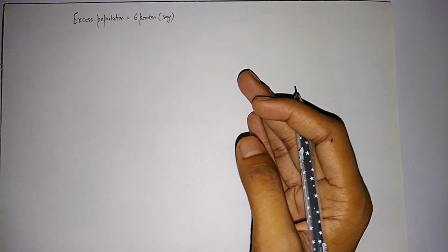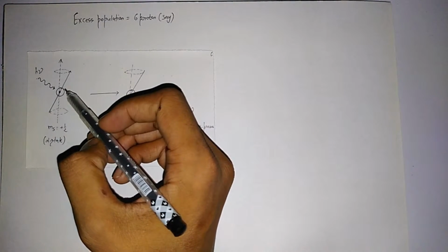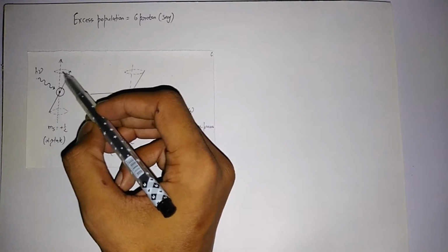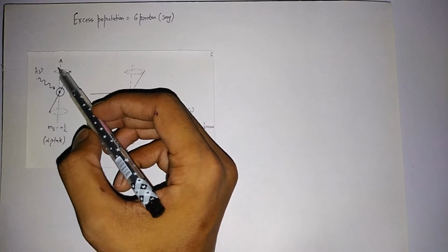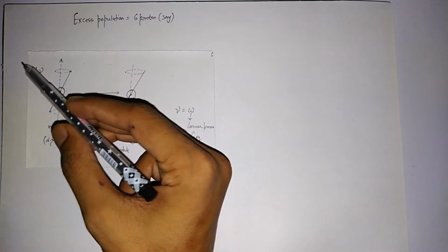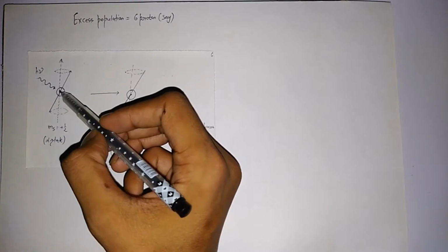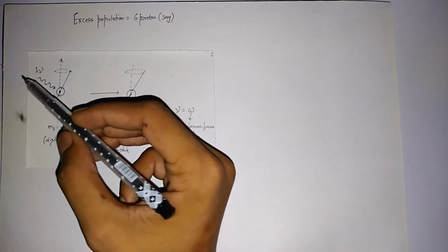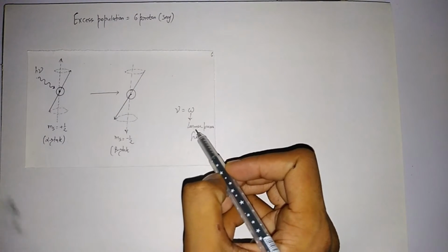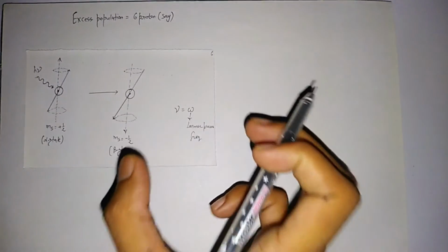And this situation can be depicted by this figure. Here you can clearly see that when you expose your compound to the external magnetic field strength, it undergoes Larmor precession, and when you then expose your compound to electromagnetic radiation of the radio wave type, these nuclei absorb the radiation only if the frequency of the incident radiation and the Larmor precessional frequency of the hydrogen nucleus are exactly the same.